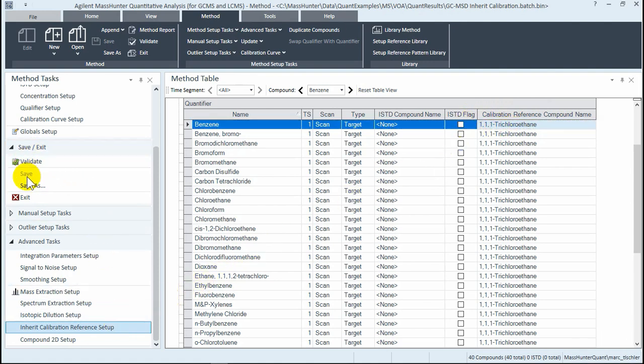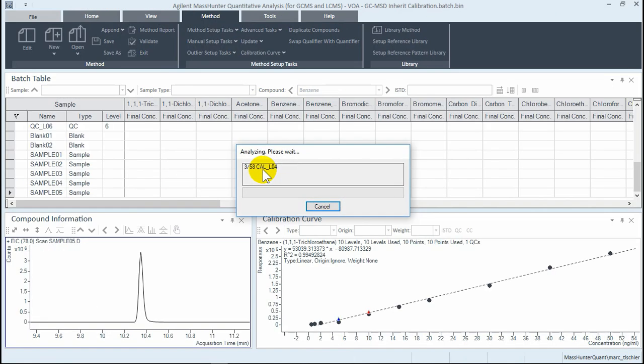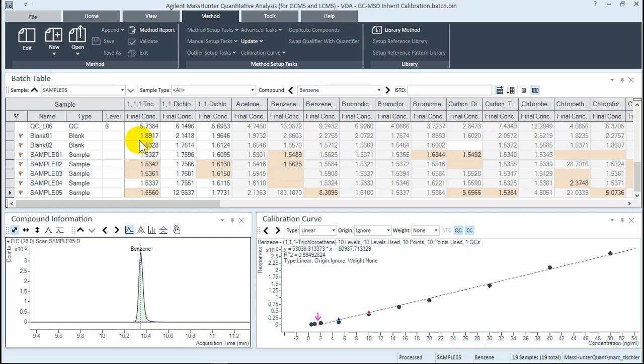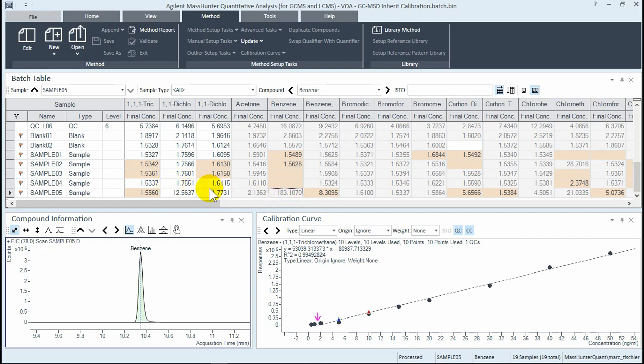We'll come back and look in more detail here. But we're going to analyze here and take a look in batch at a glance. So in batch at a glance, we can see that there's the target, and that's what we've used as the reference calibration curve. And you see that in a solid line. As we go over to the suspects and the relationship to the target, which we set up in the method editor, you'll see that there's a dotted line there, and that is the same exact calibration curve, which is shared with all of the suspects that have inherited that calibration curve.